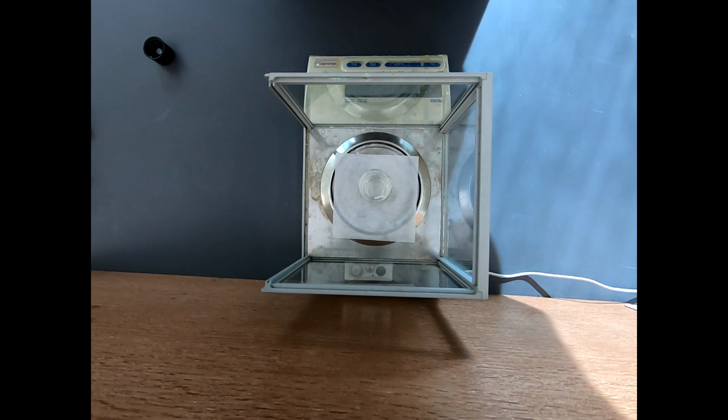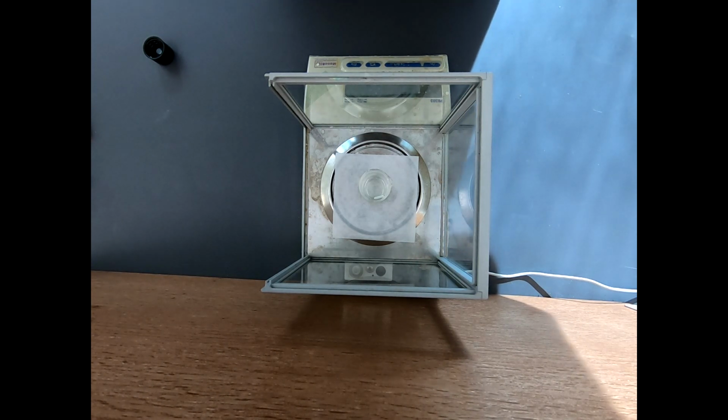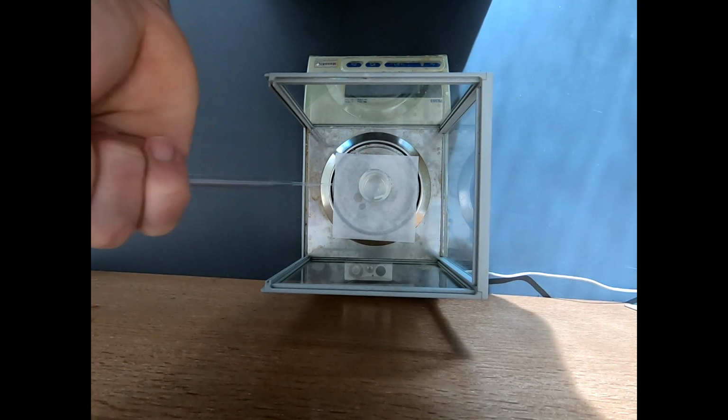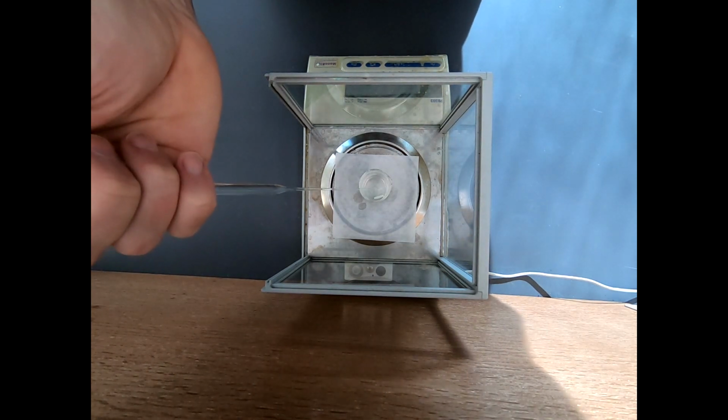So before I get too eager, let's re-tare. So I've got a nice 0 there. Now I want 6.51 of this. Oh, did you see that? That's going to be a little bit of error. I got a drop on the balance. It's not going to be a big error, but let's not deny the fact that was unintentional and not what I wanted to happen.